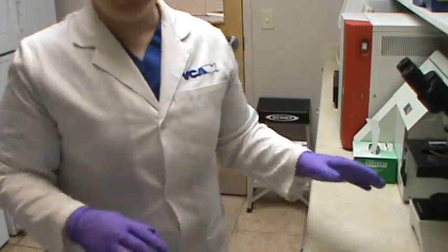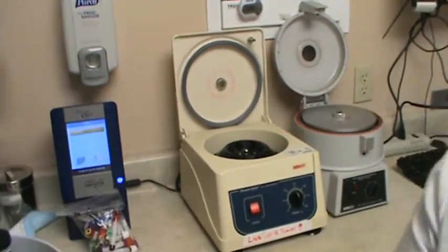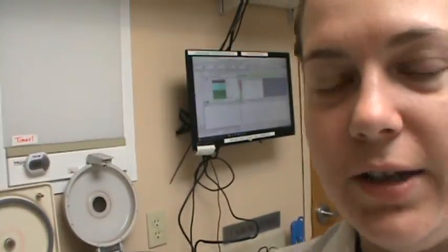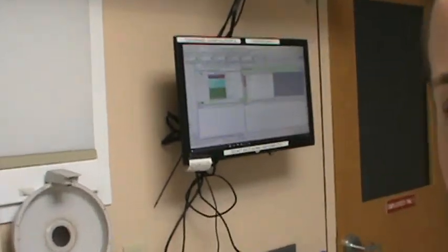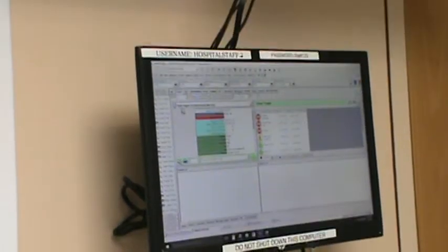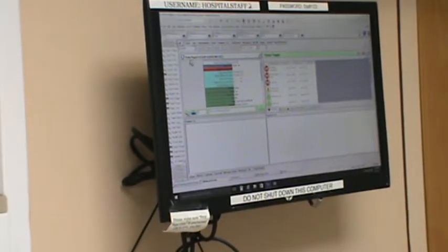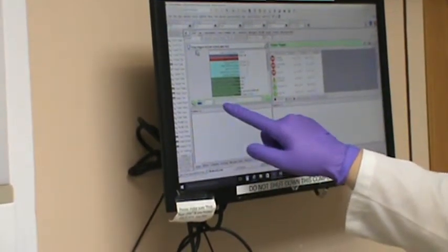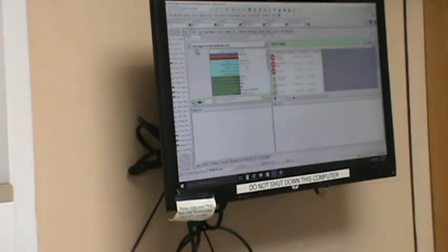And then what I'm going to do is take the camera and move it over to where my microscope was to get an angle to get a view of the computer. Because now we're just going to enter the information into the patient's record. So I'm just going to zoom in a little bit so that you can see the computer. Alright. So I already preemptively loaded up Gizmo's chart. So it's Gizmo. We are a 2-year-old black pug, male neutered.